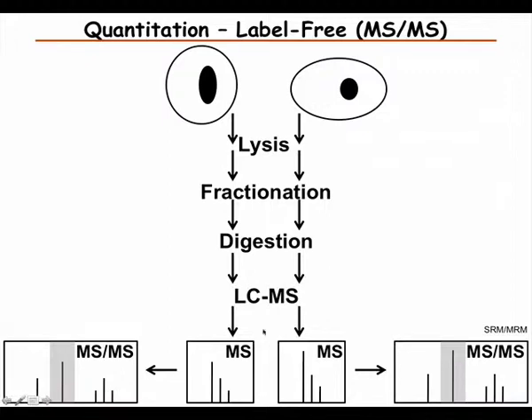So now we're going to take a small window here and isolate this isotope distribution that might or might not have interference. And then we spread out the fragments over the whole mass range here. Then the probability of having interference will decrease. We'll still have, in some cases, interference that we'll see later in the MSMS, but it's a smaller probability. So by spreading it out, we make it cleaner.